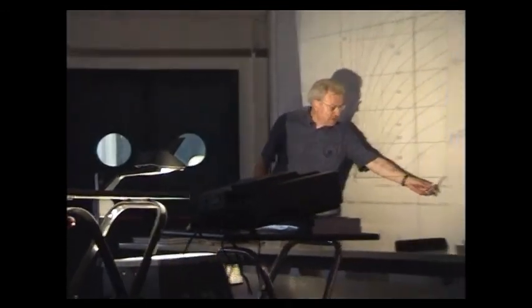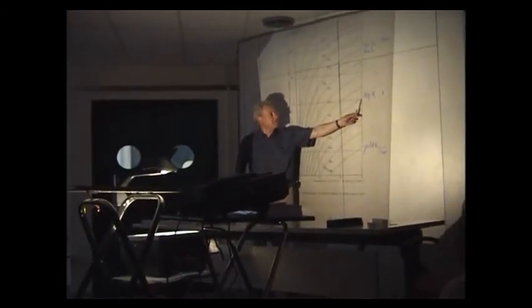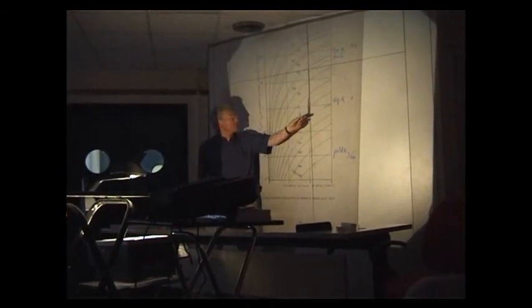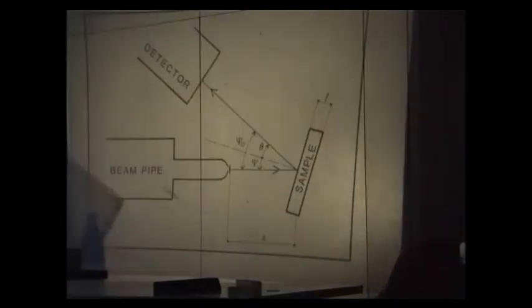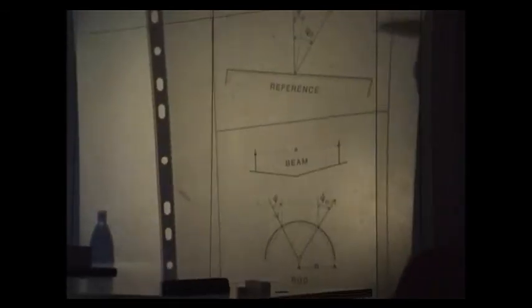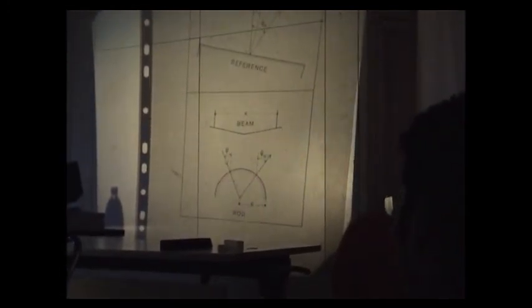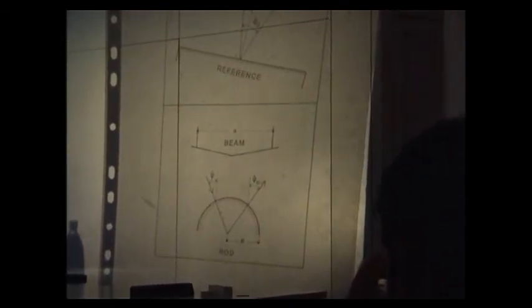Suppose we are using 3 MeV protons. We have here the cross-section, then the probability for the production of X-ray. You have to take into account that several times your reference sample is a flat one, but you have to analyze some wire, which is a circular one.